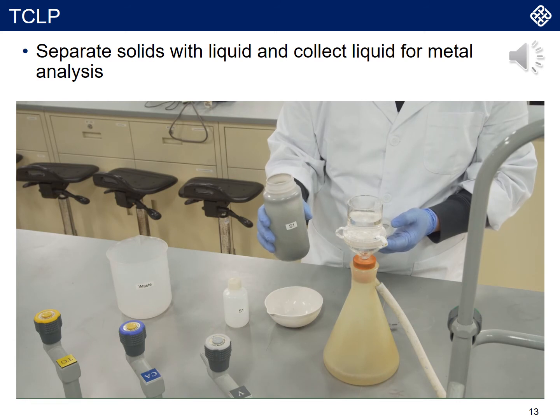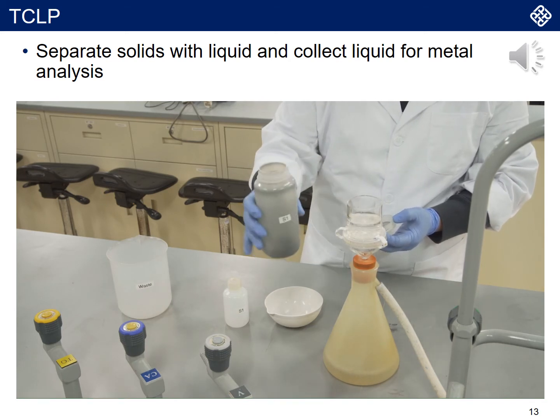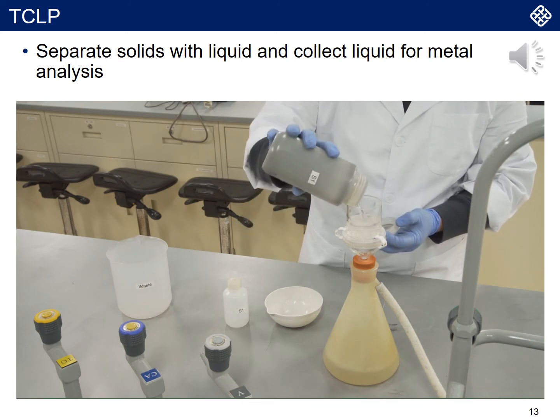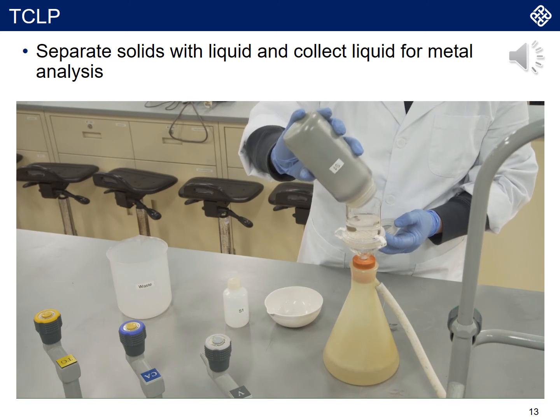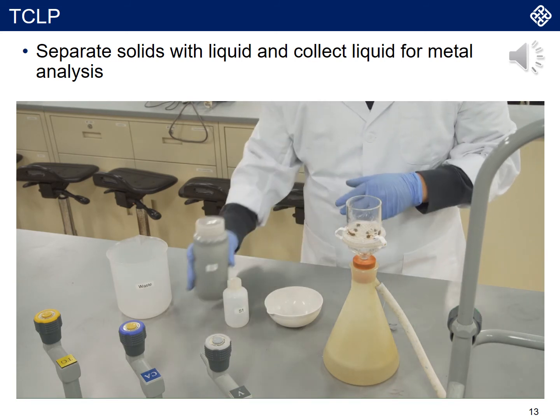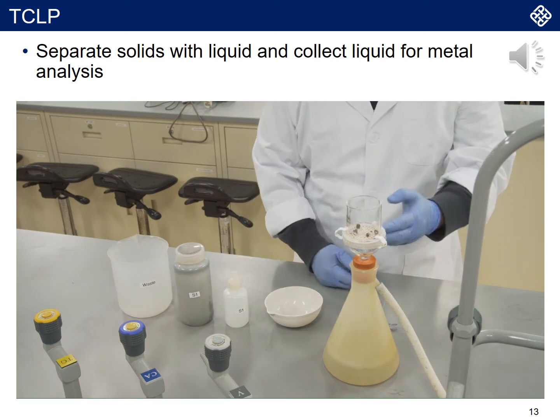Most likely what we need to do is to take the record of the overall concentrations. In this case, we can calculate how much heavy metal is dissolved with the volume, and we can calculate how much mass of the heavy metal we got.